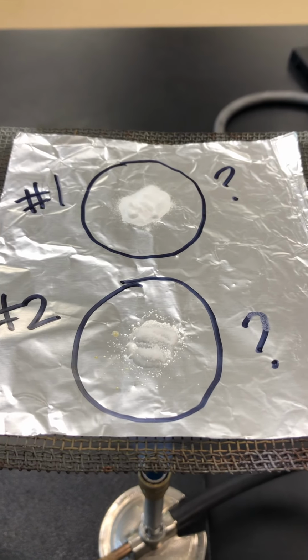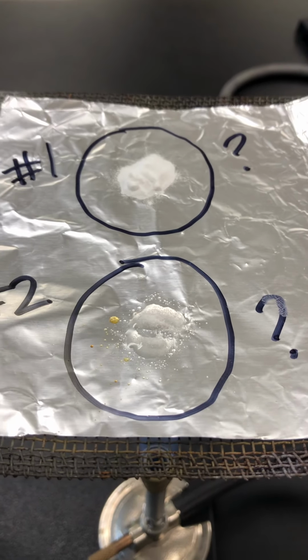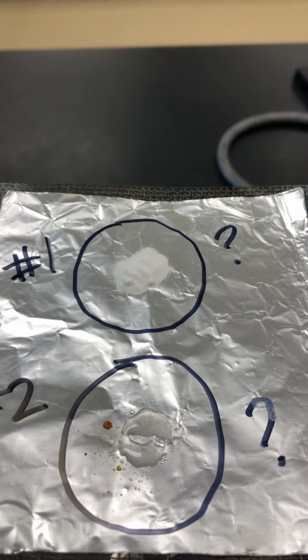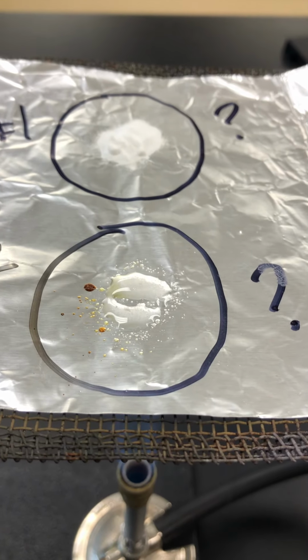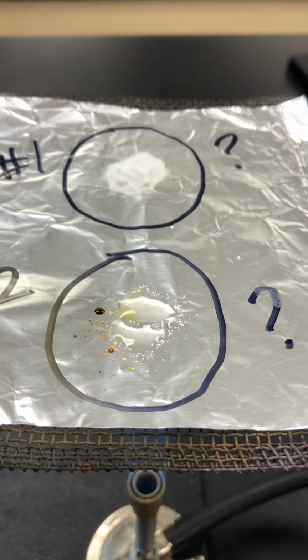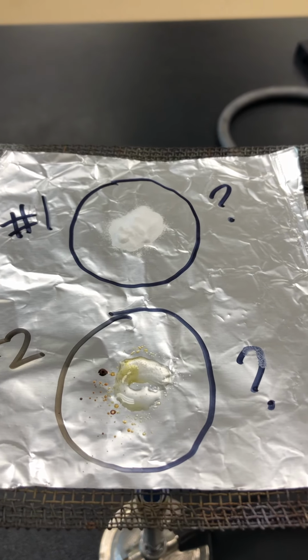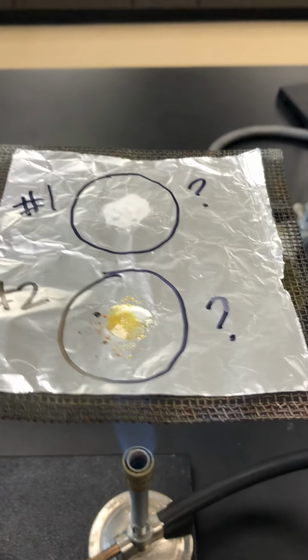So it looks like there's some change happening to unknown 2. You can see it's kind of getting dark and starting to boil. The top one, I don't see any change in that one. So the bottom one is almost completely liquid at this point. Wait a couple more seconds to see if I see a change in the top one. Nope, it doesn't look like it's gonna melt. So I'm gonna go ahead and turn this off.